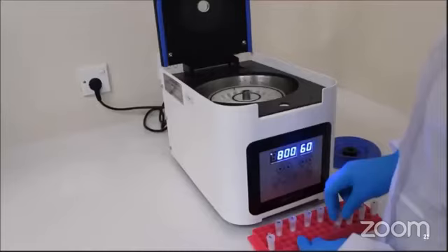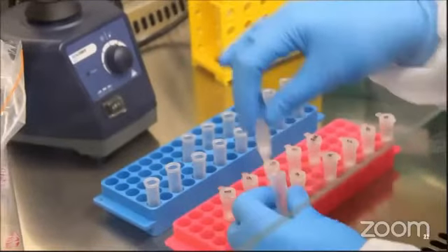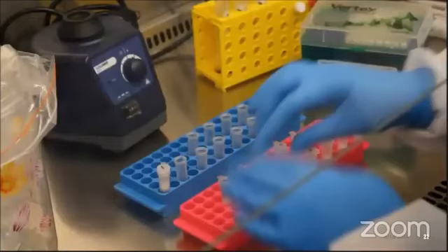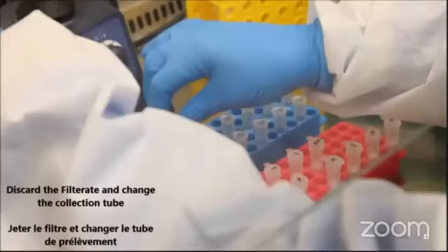After centrifugation, you can see the filtrate in the collection tube. Remove the collection tube and place the column in a fresh collection tube.